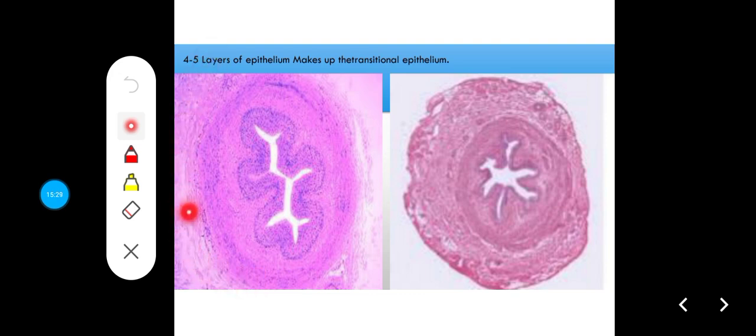Notice that the extra connective tissue layer doesn't stain as much as the muscle layer because you do not have the dense packing of cells in connective tissue as much as you have it in the muscle layer. So the same thing here. And then this extra connective tissue layer helps us to differentiate the ureters visually from the esophagus. They are histologically different. So visually, they might seem confusing, but I hope this explanation will clarify that. So that's it for the ureters.